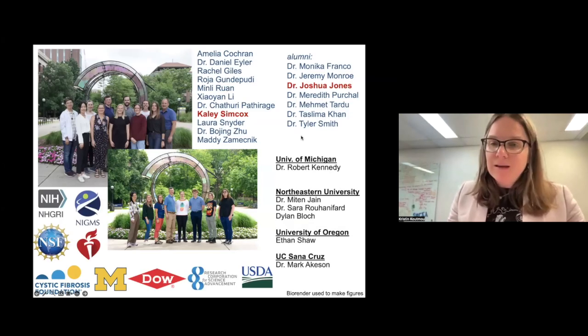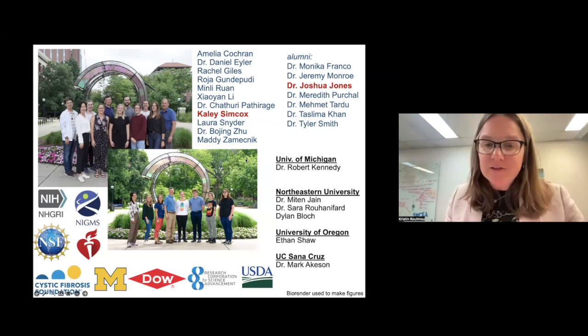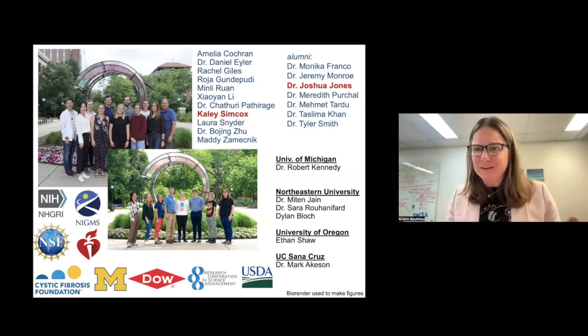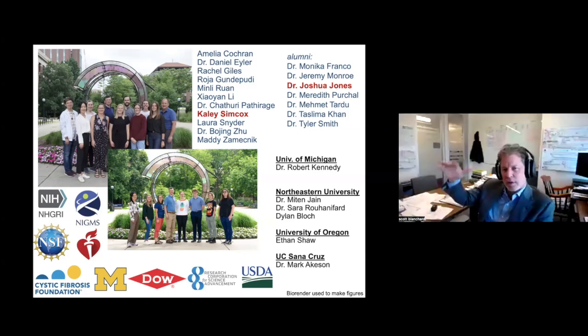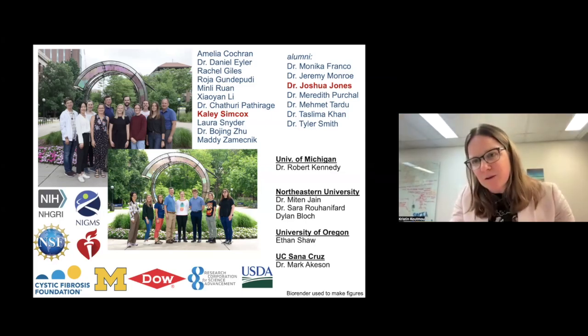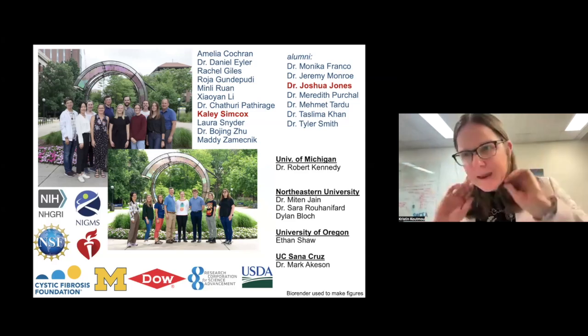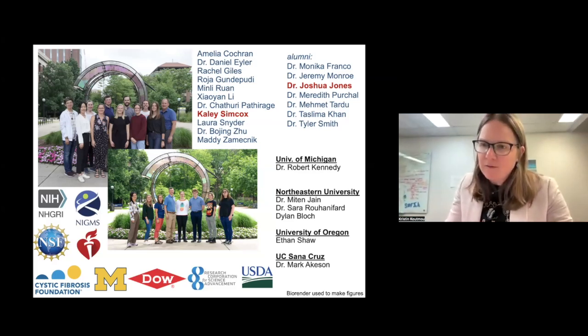Yeah, so the folding in our hands, yes, it does give robust results. We do get reproducible results. And it's just like any other tRNA folding that one as a biochemist does on a regular basis. You just heat and fold. Does that mean you have denatured it before you refold, like by gel electrophoresis or something? So we haven't. The procedure that we use is that we first run an FPLC in order to get tRNA fractions. We then do a prep HPLC in order to further purify those fractions so that we're just tRNA, and then we follow up from there.